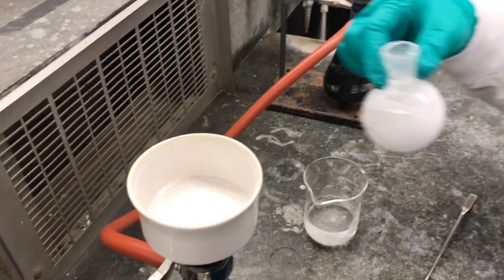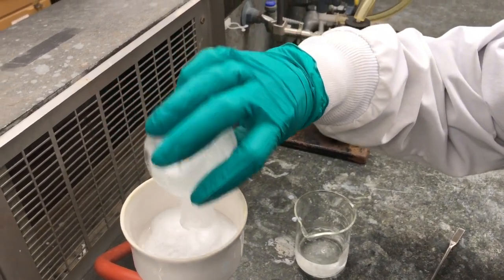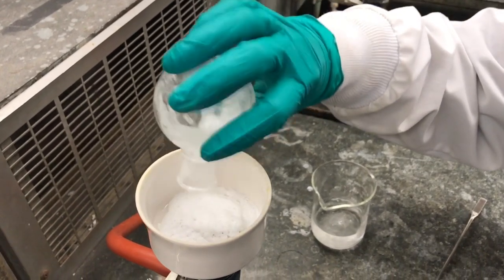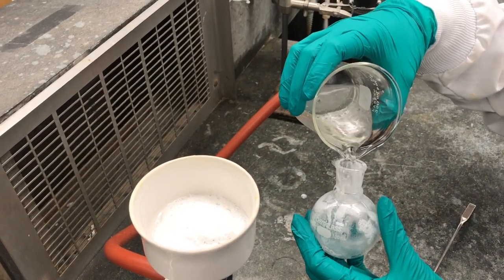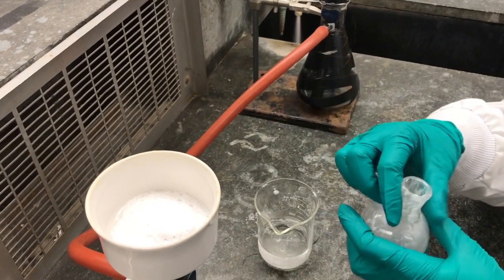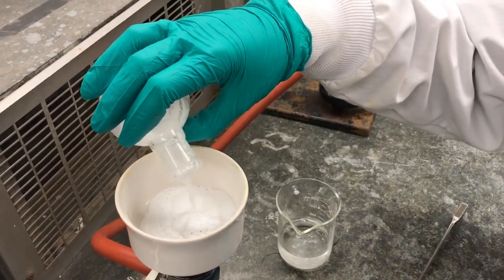Now we are going to pour our reaction mixture through. We're going to rinse it with a little water, trying to transfer as much as possible. This one does not dissolve in water, so there is no chance of it going inside.